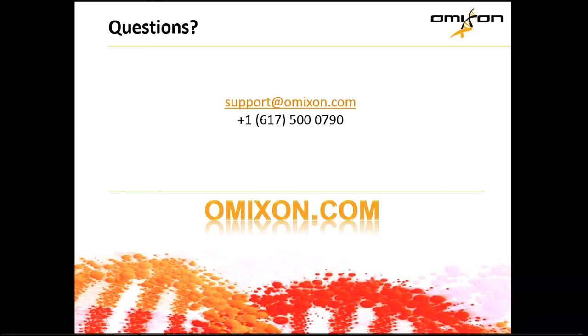Thank you very much, Dimitri. One further question. Do you use beads in the protocol? We use beads in the protocol at some point, but we don't use beads for selecting sizes.